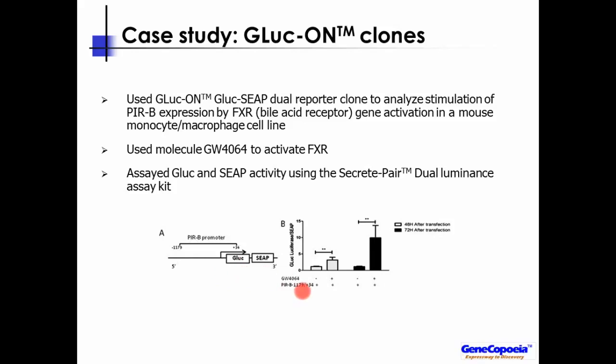When they treated the cells with GW4064, they found a moderate stimulation 48 hours after transfection. But then 72 hours later, they saw a much larger response. And again, this is an indirect response to GW4064, showing that the FXR protein can stimulate this promoter.